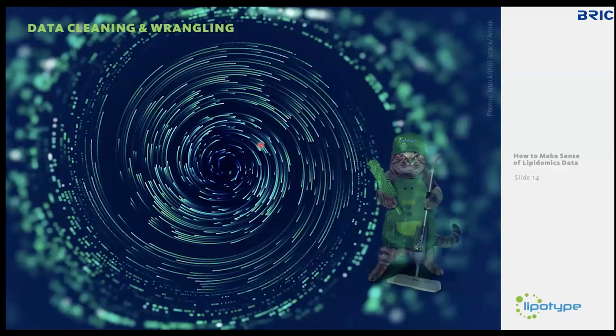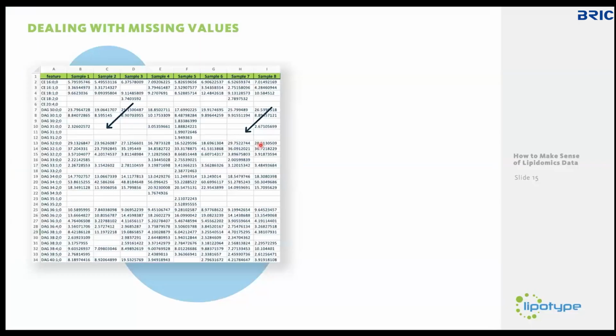And the first thing you actually notice is that the data that you're getting has some blank spots. These are usually NAs, which in this case are true NAs, because we do not know what the value is there. So there are multiple ways you can deal with that. Sometimes you need to deal with it because some later analyses need a complete data set.